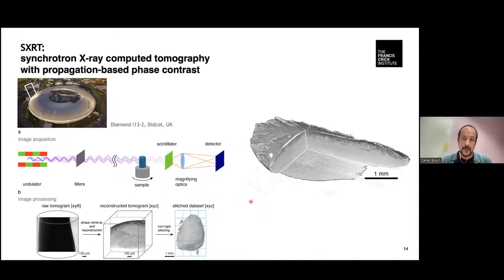Now, because both absorption and scattering are properties that scale up with the atomic number of an element, it is not surprising that soft tissue samples stained with heavy metals and embedded in resin work well with X-rays, notably because they have preserved ultrastructure when we process them in the same way and with the same care as we usually do for electron microscopy.